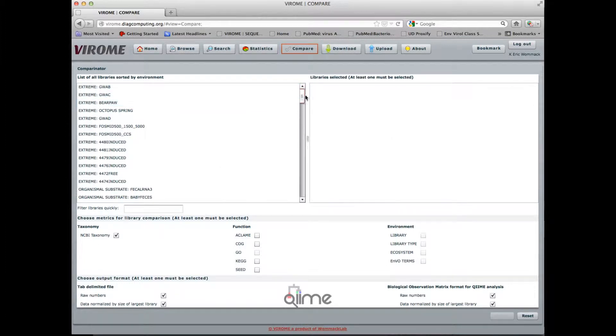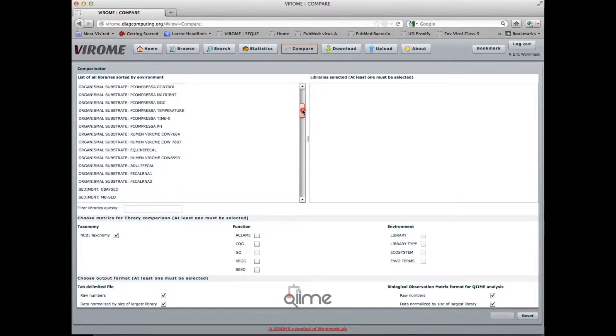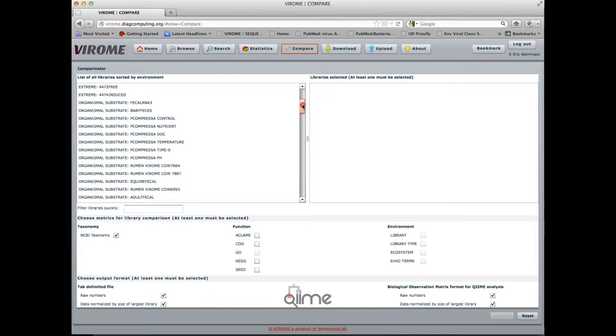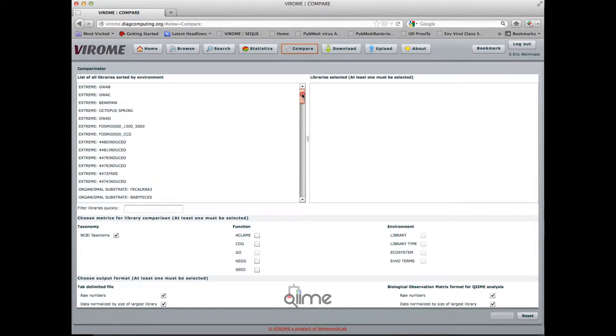Here you'll see a list of all the libraries that you are authenticated to view, including private and public libraries.